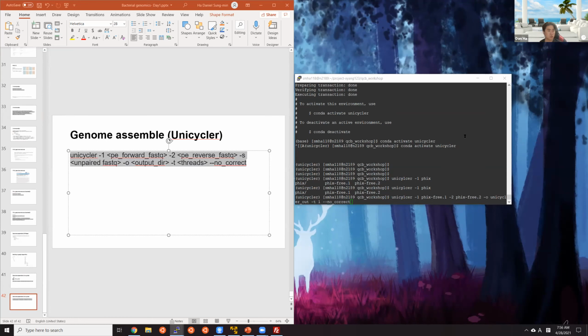You don't need to run conda init. But every time you reopen the console or get a new node, you can always reload your Conda with the module load command.